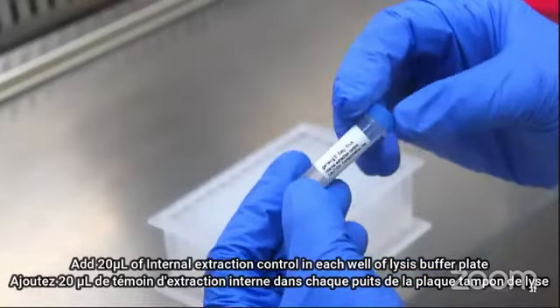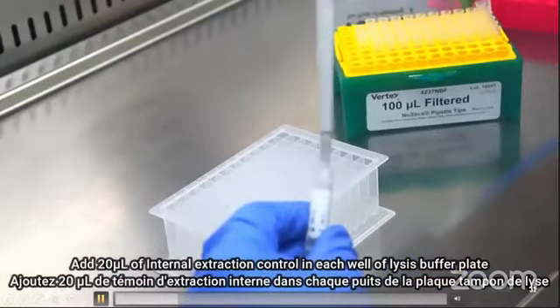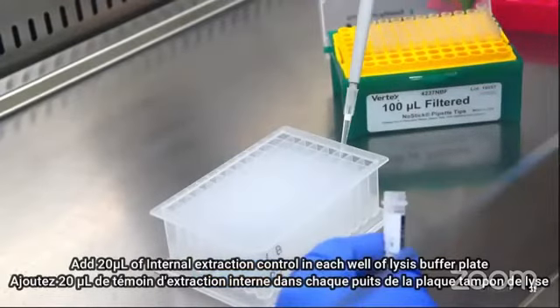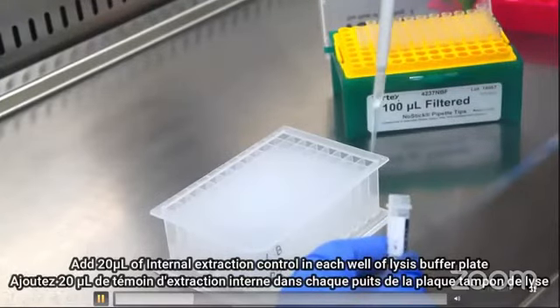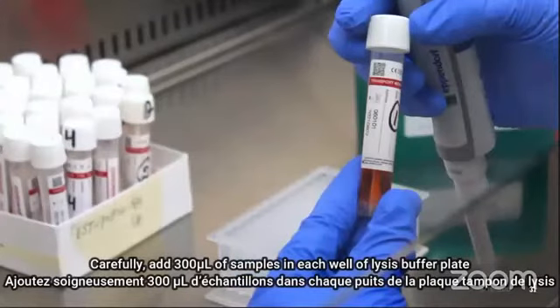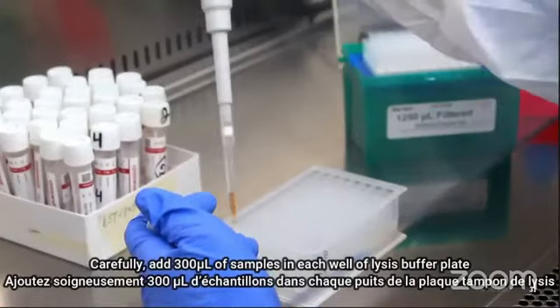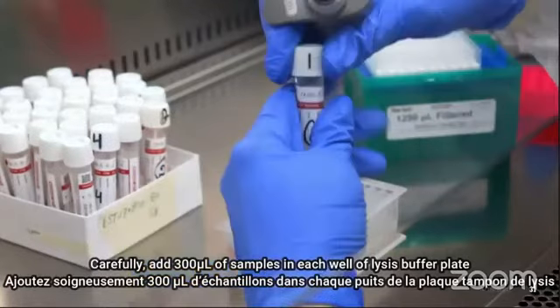Like manual extraction, we are adding here 20 microliter of the extraction control into the deep well plate containing the lysis buffer and the proteinase K. So after the addition of internal control and proteinase K into the lysis buffer plate, now carefully add the 300 microliter of sample in each well. Care should be taken over here.